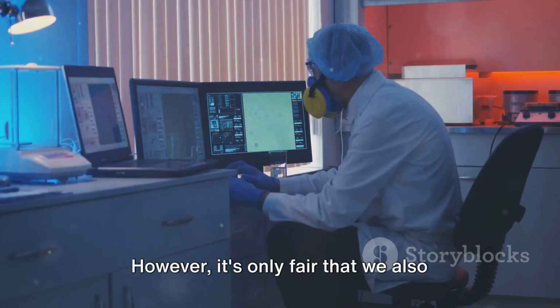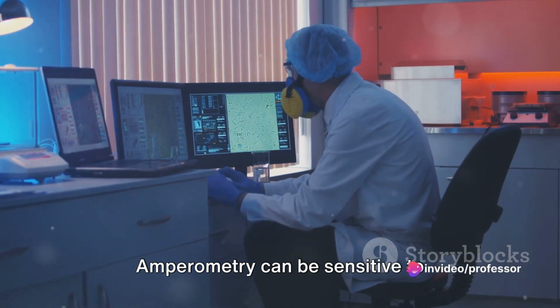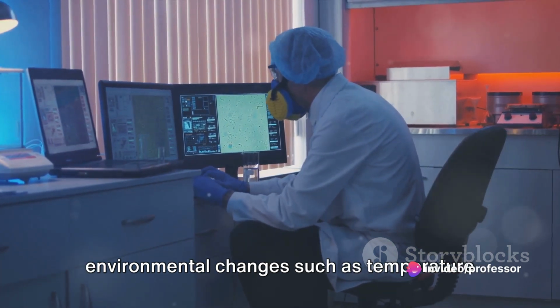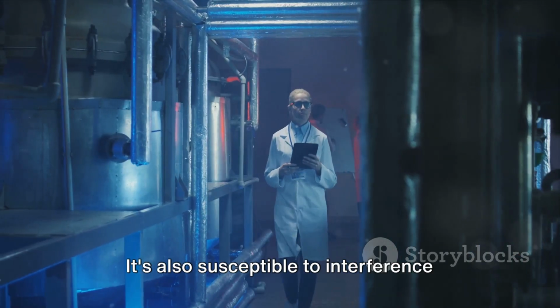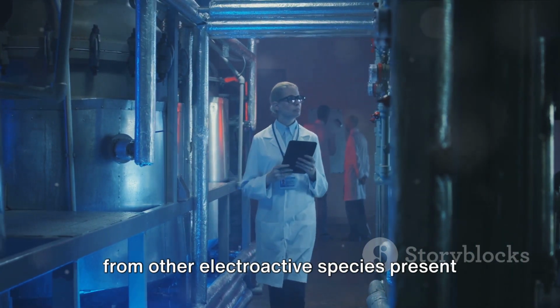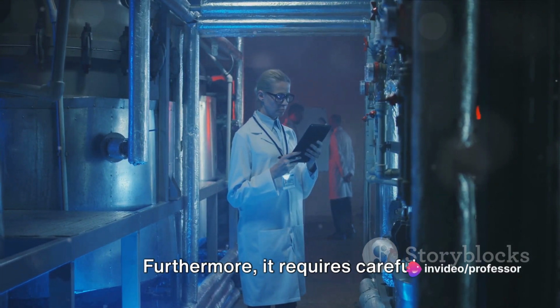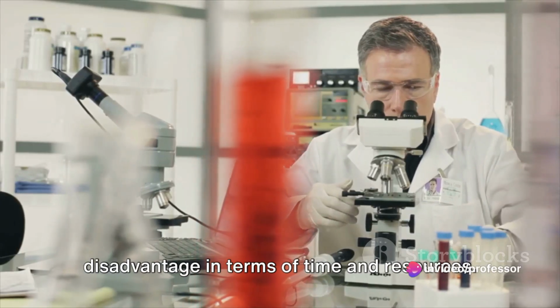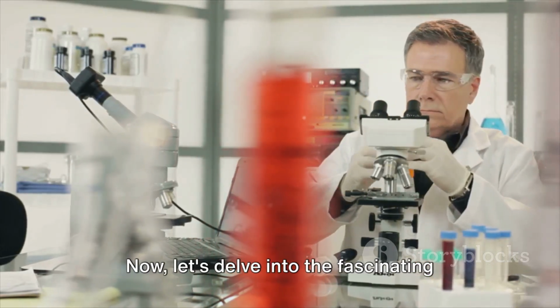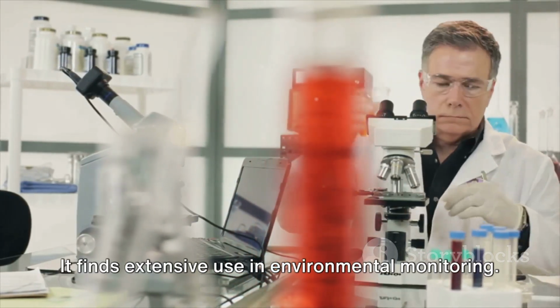However, it's only fair that we also discuss the disadvantages. Amperometry can be sensitive to environmental changes such as temperature or pressure, which may affect the accuracy of the results. It's also susceptible to interference from other electroactive species present in the sample. Furthermore, it requires careful calibration and maintenance of the electrodes, which could be considered a disadvantage in terms of time and resources.